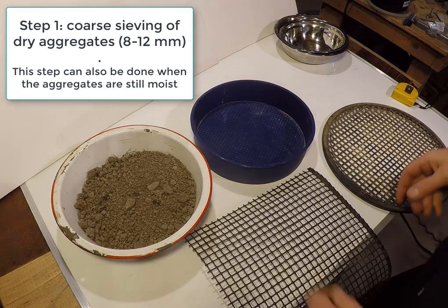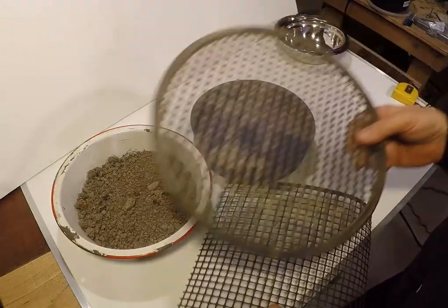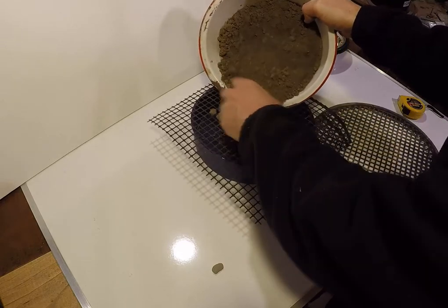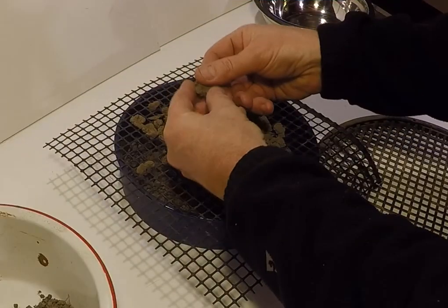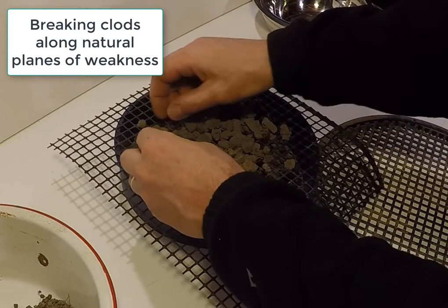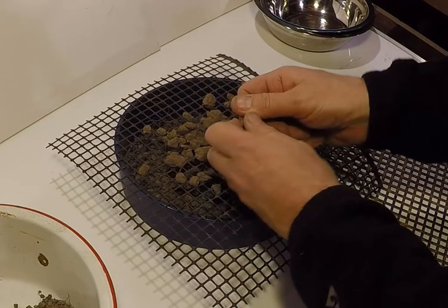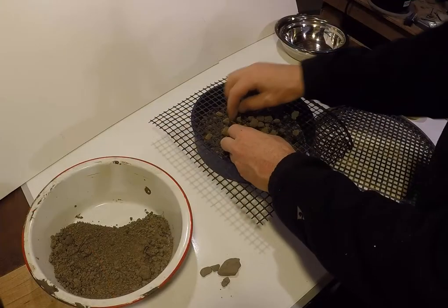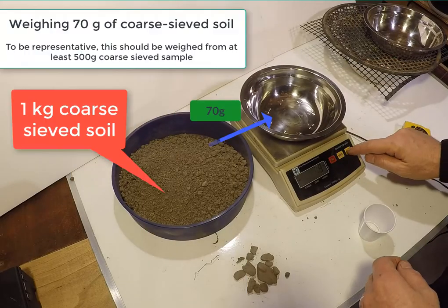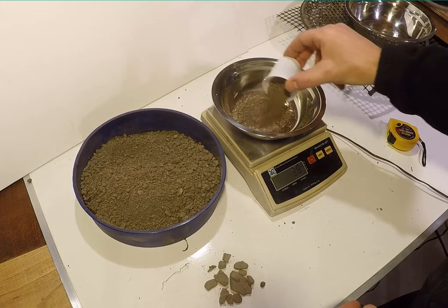First, the soil is passed through a large-sized sieve of size 8 mm to 12 mm. Larger clods should be gently broken by hand along natural planes of weakness rather than forcing them through the sieve. Large stones and large pieces of organic matter can also be removed at this point. After sieving between 500 g and 1 kg to create a representative batch of soil, 70 g should be weighed for the analysis.